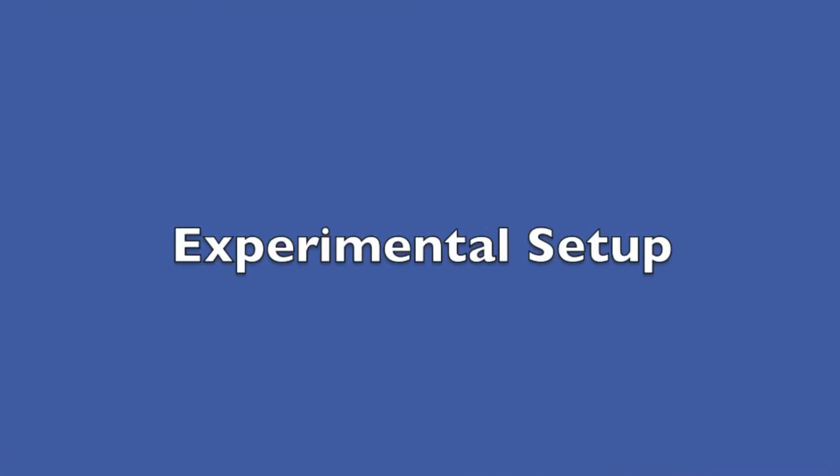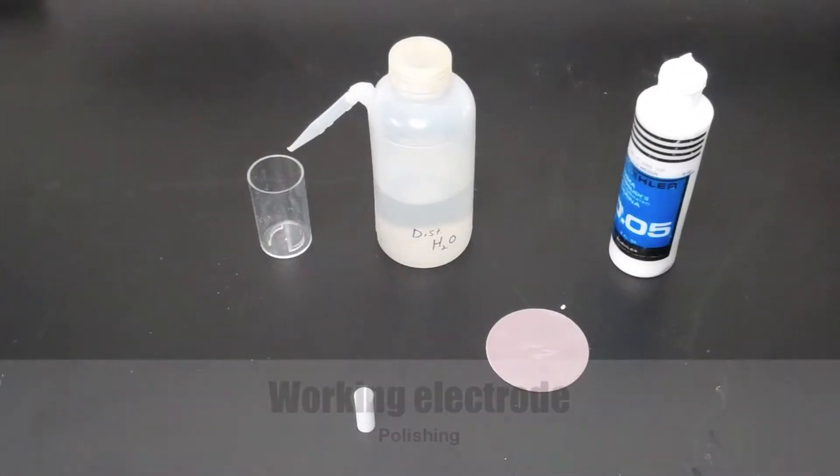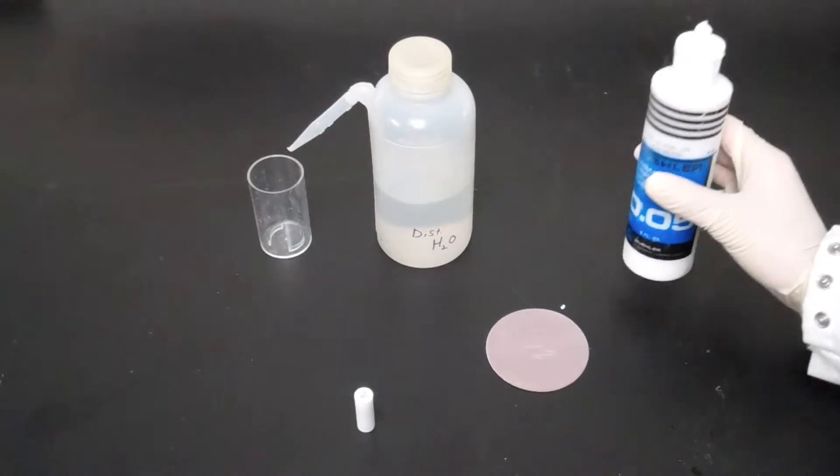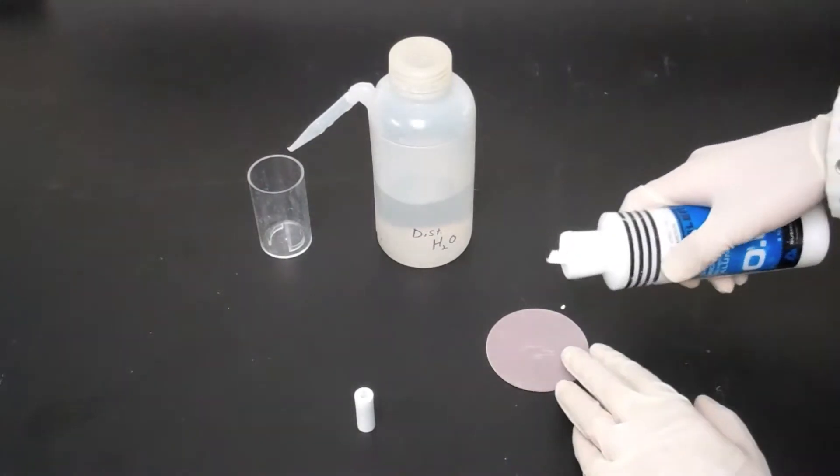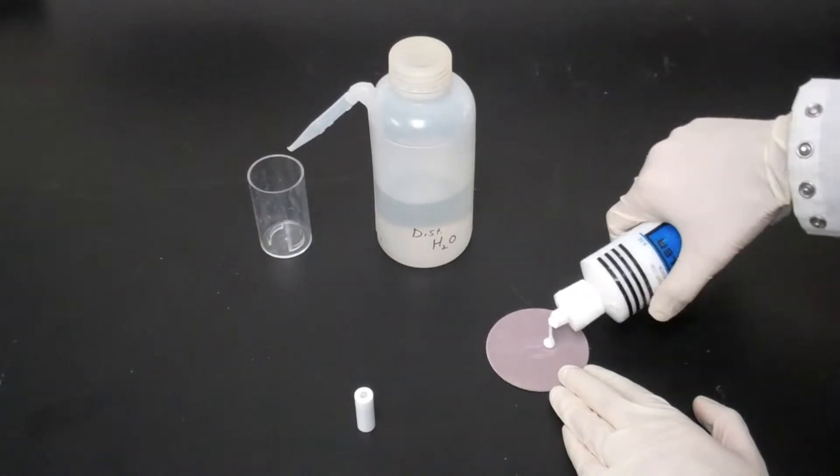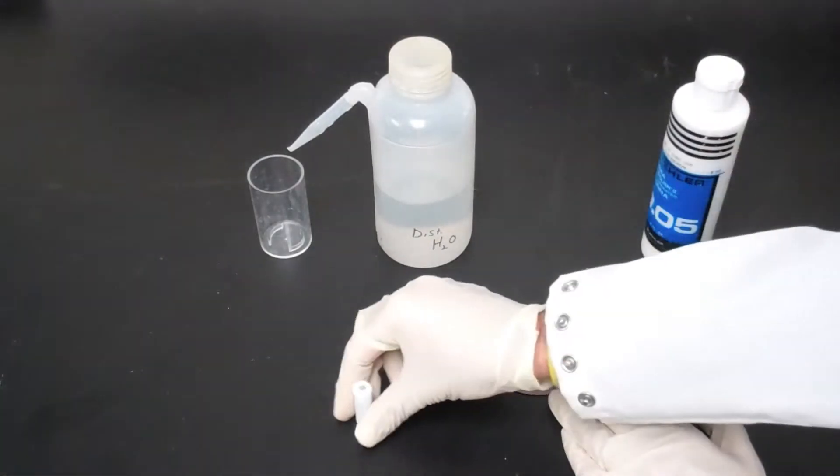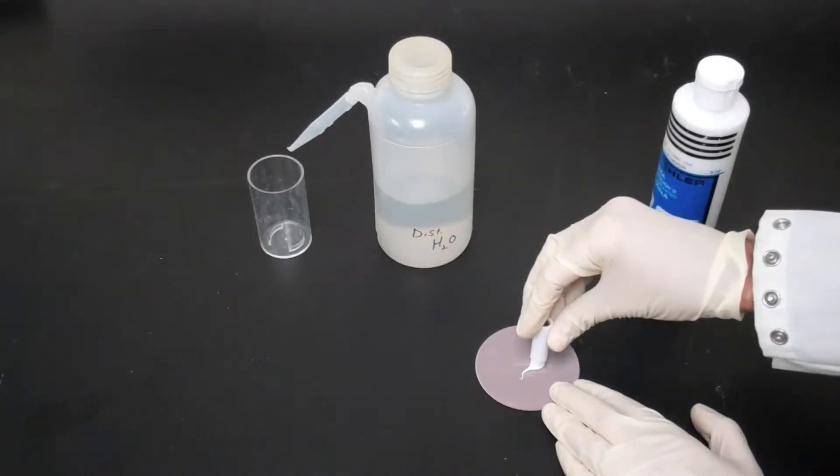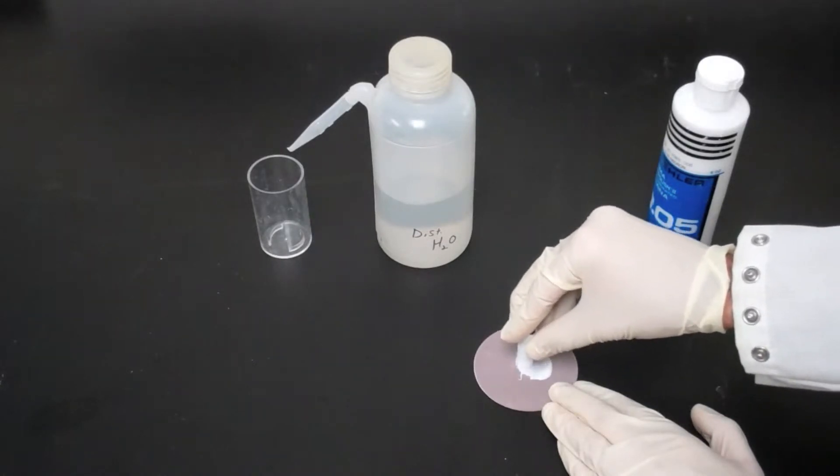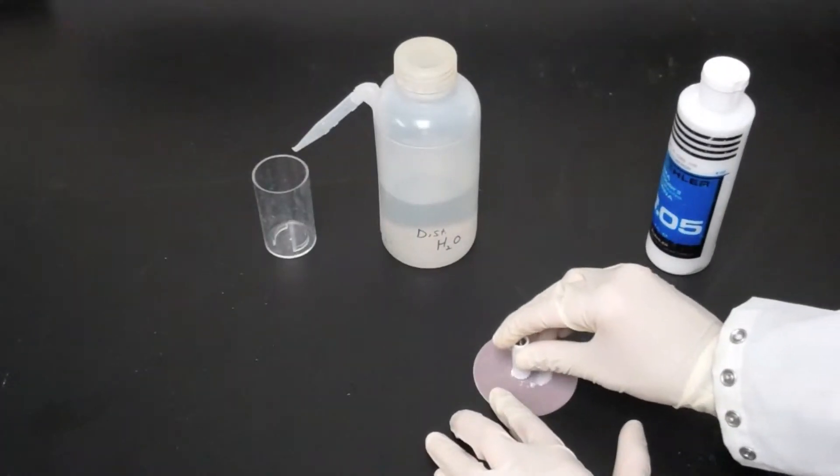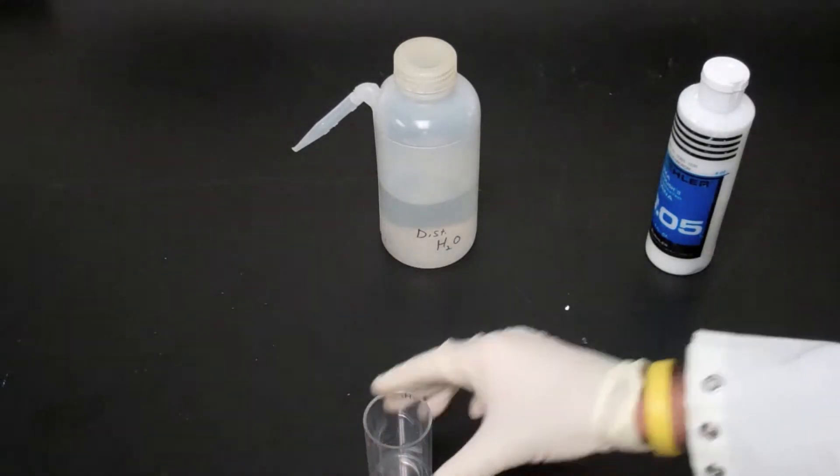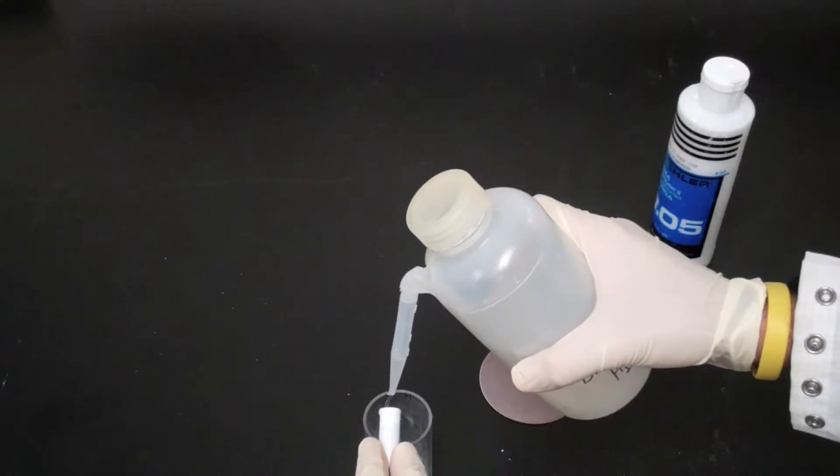Experimental Setup. Before the experiment can begin, the platinum electrode must be polished. Start by placing a small amount, about 3 milliliters, of 0.05 micron alumina polishing compound on a piece of filter paper. Taking the electrode, gently rub the electrode on the polishing compound moving in small circles for about a minute. When this is done, rinse the electrode off with distilled water and clean any remaining residue with a kim wipe.